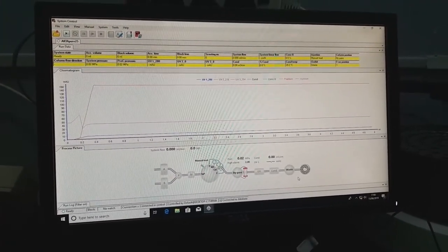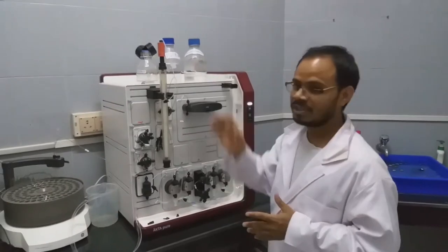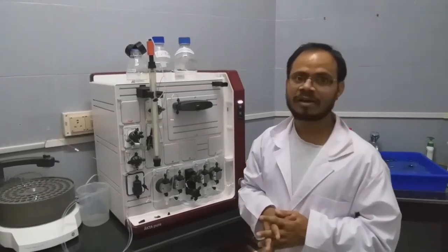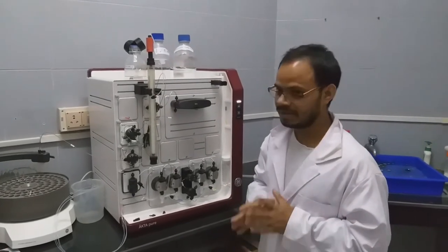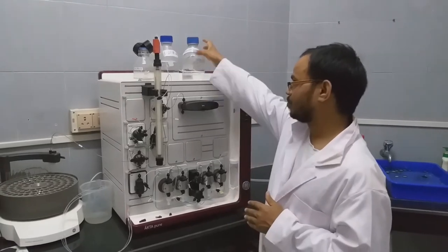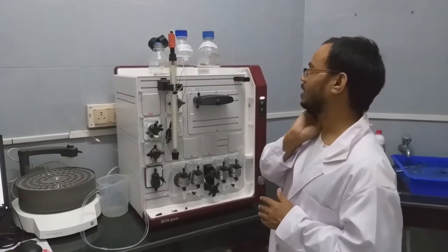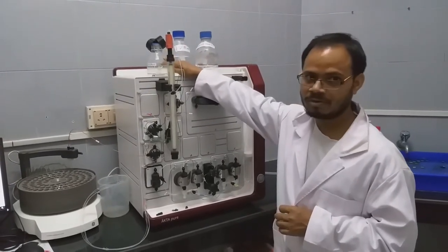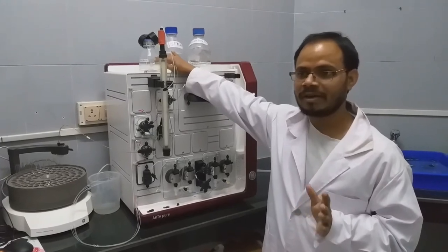This is the software introduction. These are the buffers we are going to use for this demo. The buffers need to be filtered through a 0.2 micron filter and also degassed. For degassing we will use a bath sonicator, which will remove any air present in the buffers. We are using the most common buffer — phosphate buffer at pH 7.4 — along with MilliQ water and 20% ethanol. All buffers were filtered through a 0.2 micron filter and degassed.